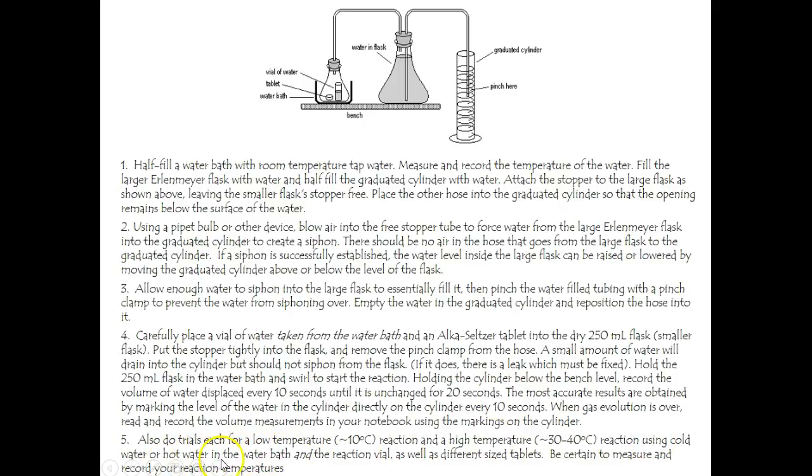using cold water or hot water in the water bath and the reaction vessel. It's not negative 10. I was wondering, everything's going to freeze. About 10 degrees and about 30 to 40 degrees. You can measure the precise temperature, but you want it to be somewhere near that. Be sure to measure and record your reaction temperatures.